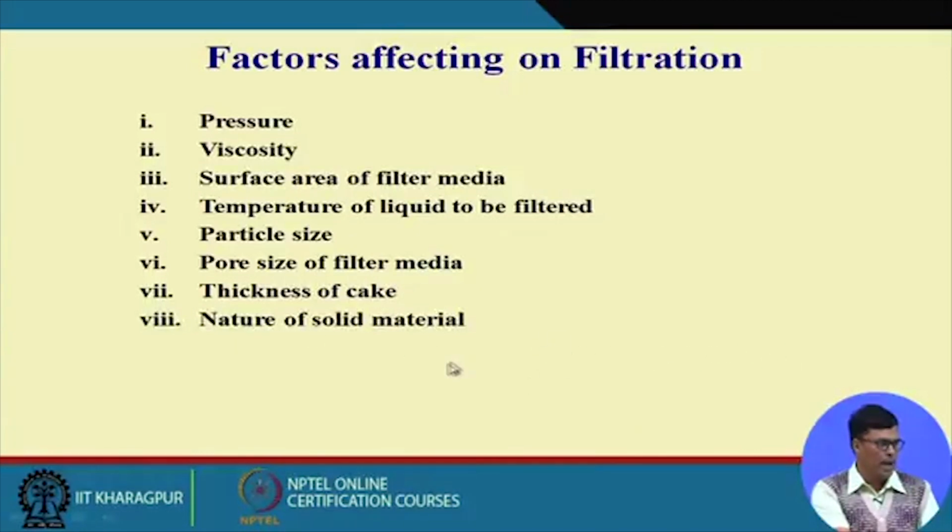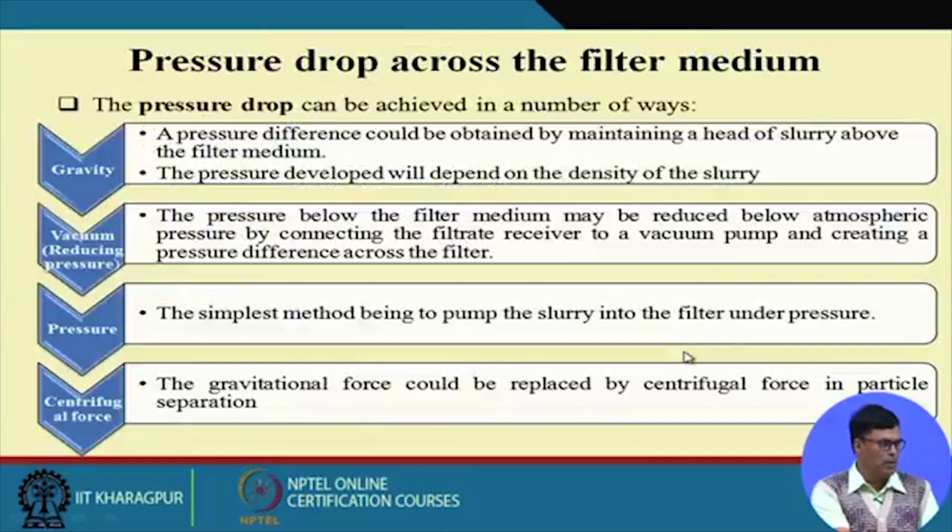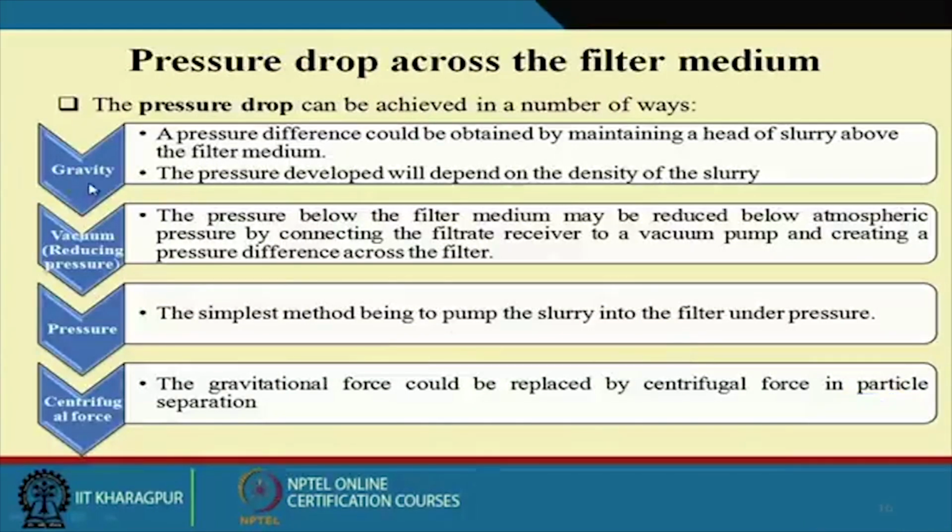So there are different factors that affect the filtration process. The pressure drop across the filter depends on gravity, vacuum, pressure, and centrifugal force.